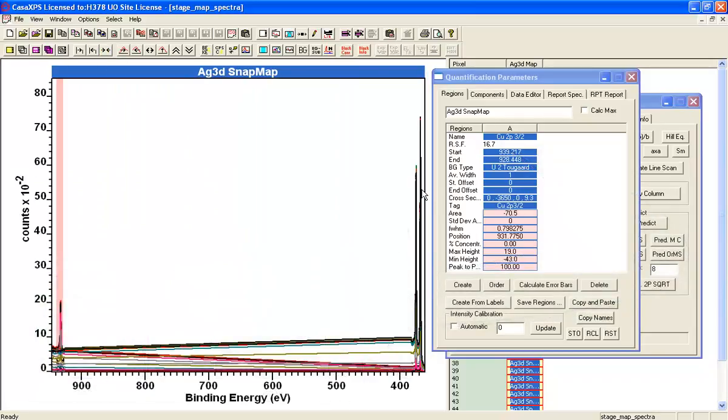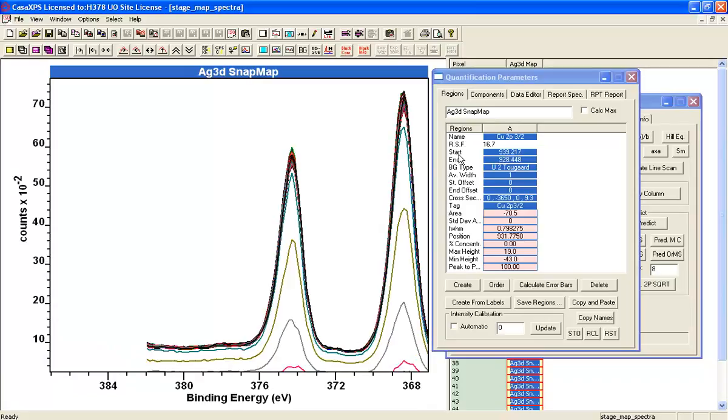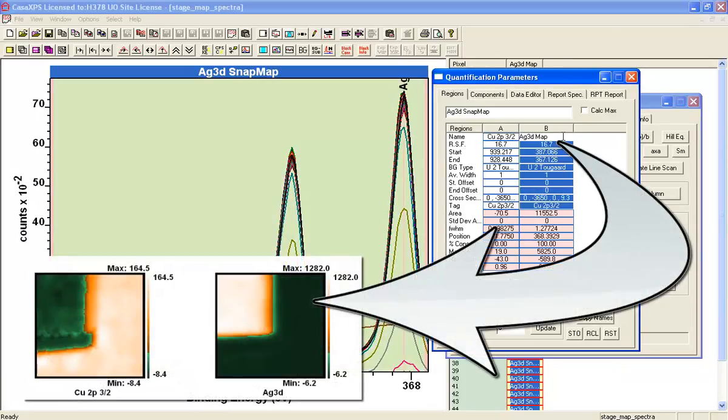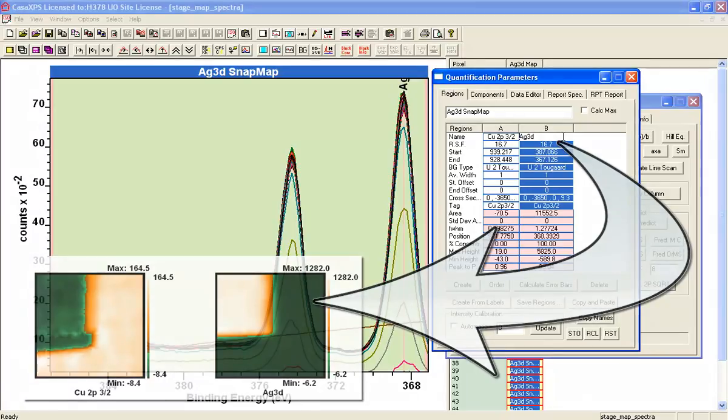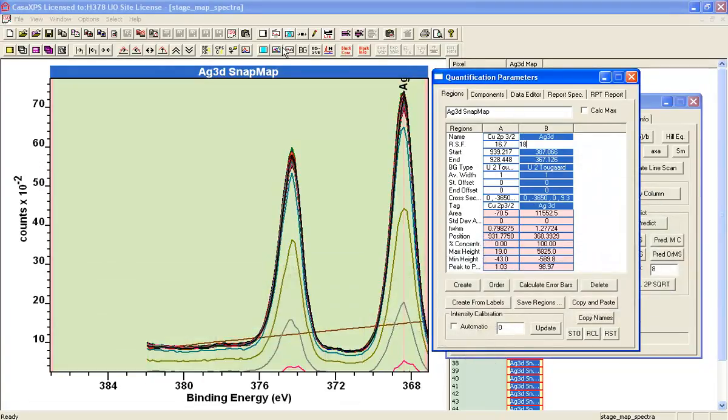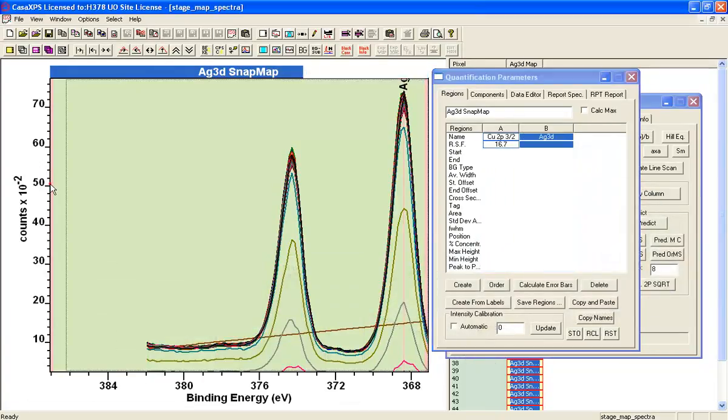Similarly we can zoom into the silver, create a silver 3D region, and again we'll bring in the information from the element library.